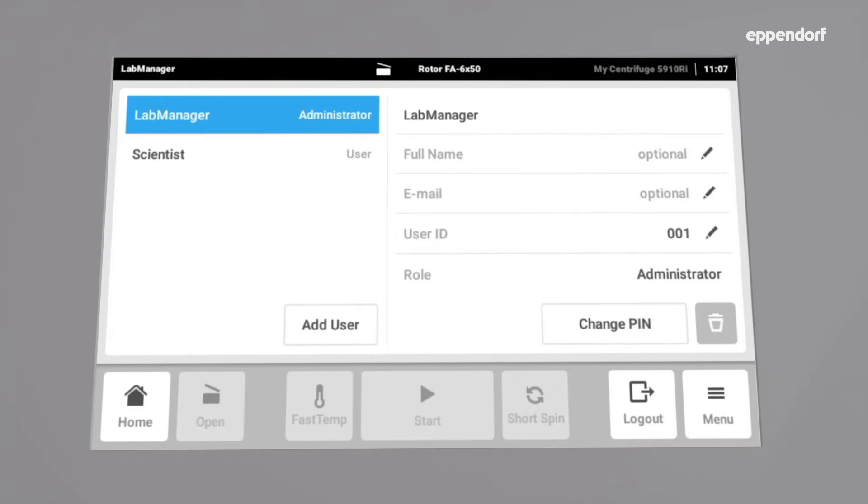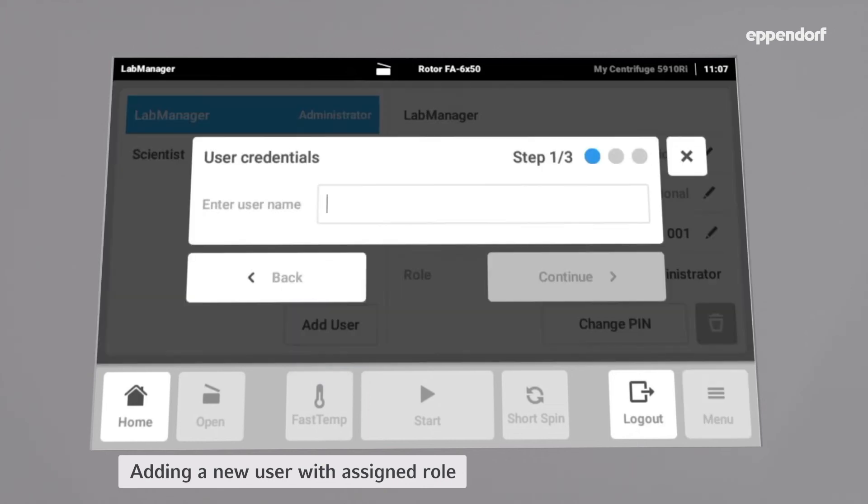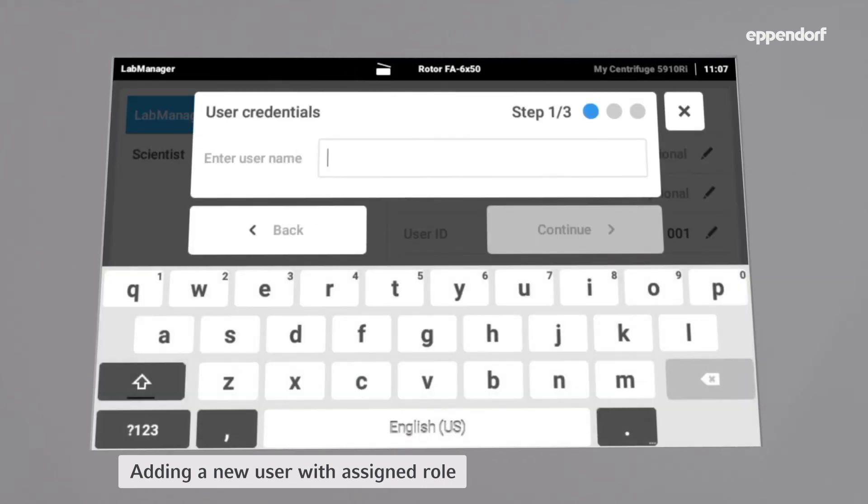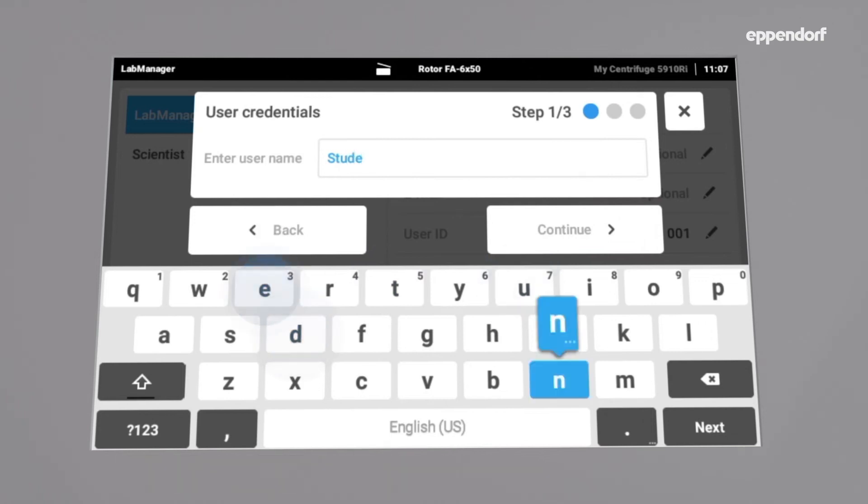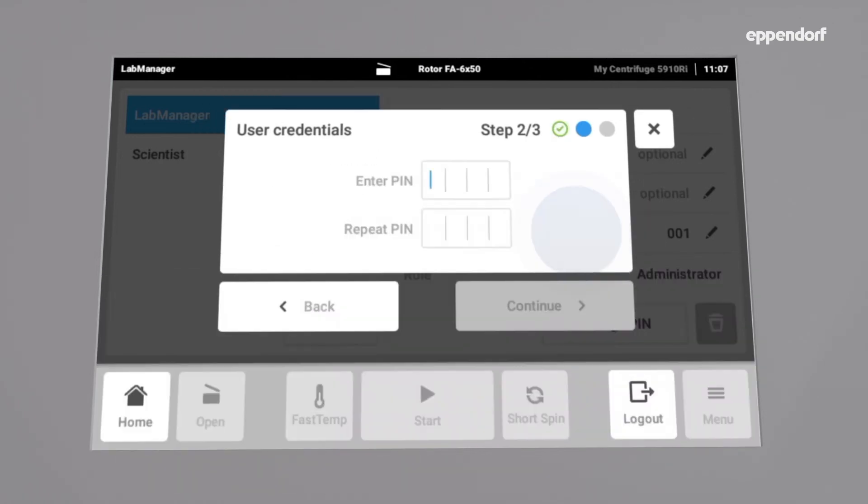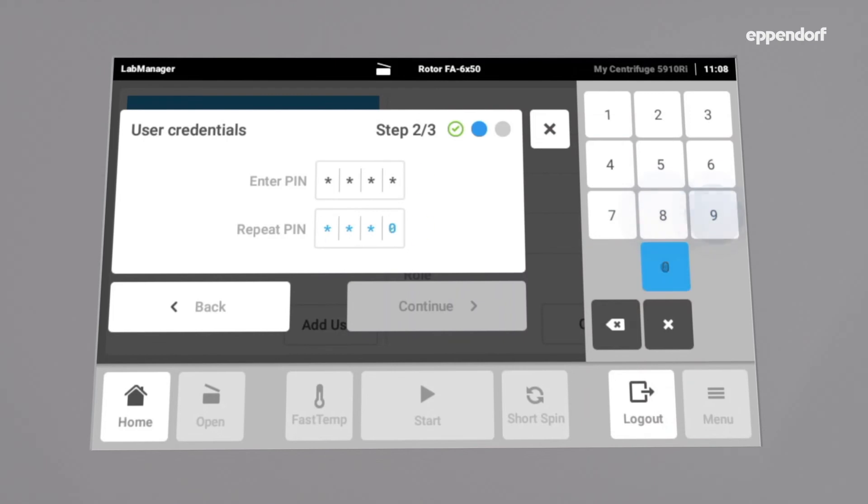Adding a user is easy. Tap Add User, then enter the user name. Choose a PIN, repeat the PIN, and finally select the role of the new user.